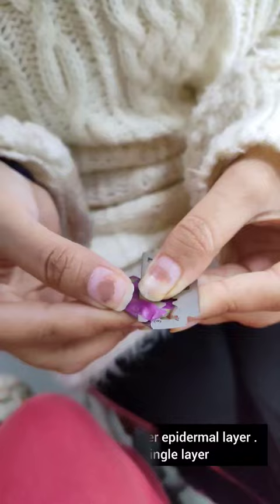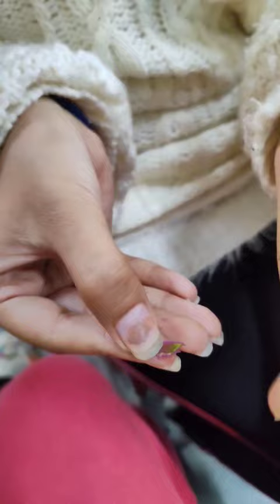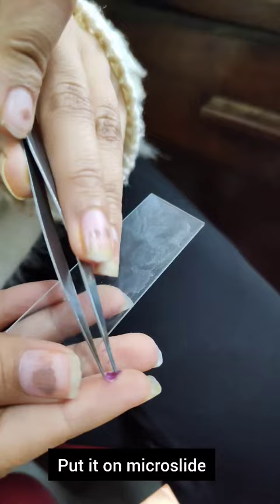Now there are some mesophyll cells which have to be removed. So I scratch them out with the help of a blade. As you can see, after scratching, there are no mesophyll cells remaining. Then I put it on the micro slide with the help of a forceps.